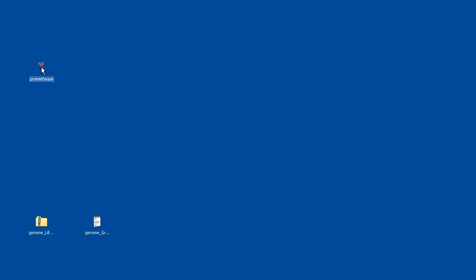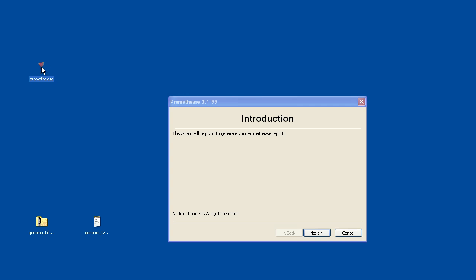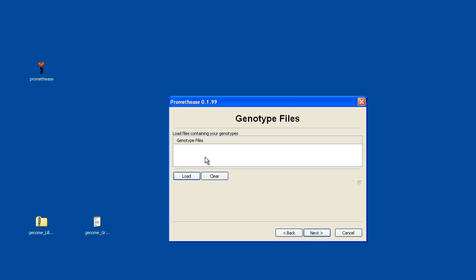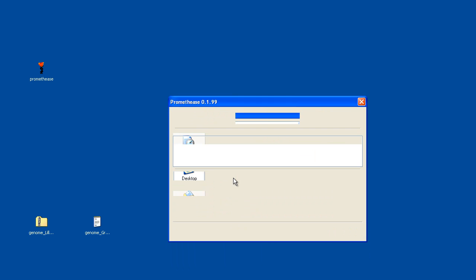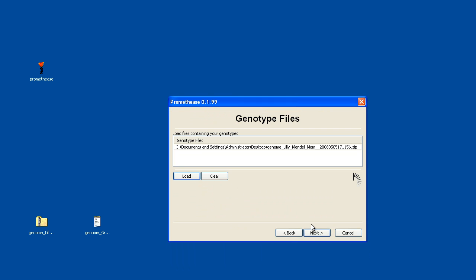This video tutorial will illustrate some of the features of Promethease 0.1.99 release. I'll begin by clicking on Next here and clicking on Load. This brings up the browser.